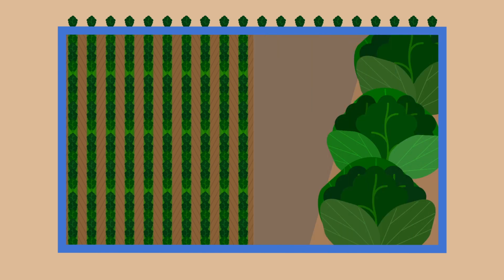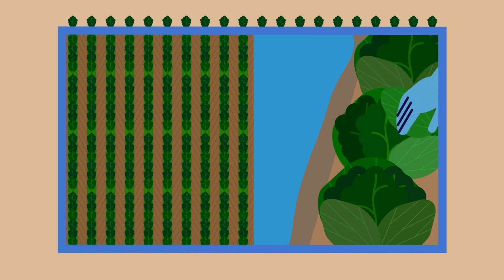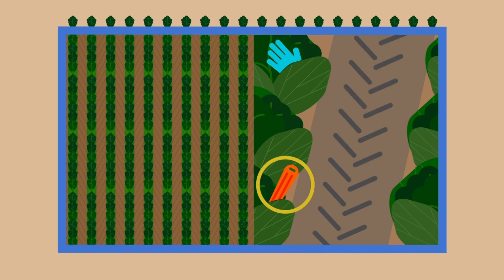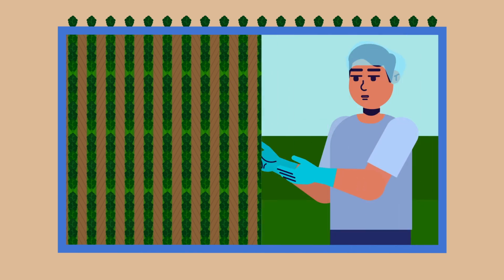Additionally, when assessing the possibility of contamination via furrow irrigation water, collect leaf samples from beds at the irrigation discharge point of the field, the head row area. Focus on leaves that would contact harvest tools, mechanized harvest equipment, or harvest workers' gloves and apparel.